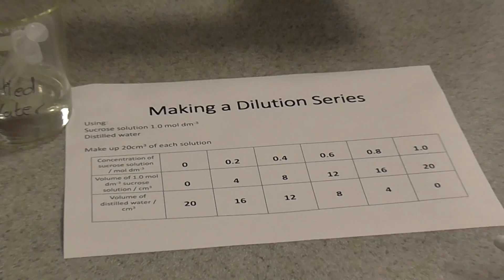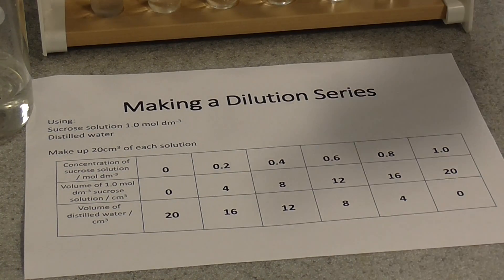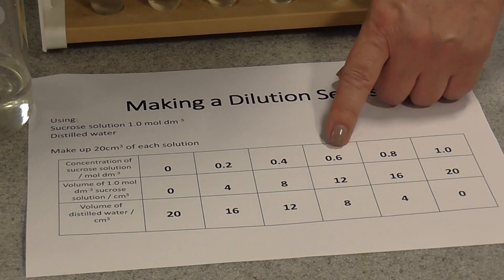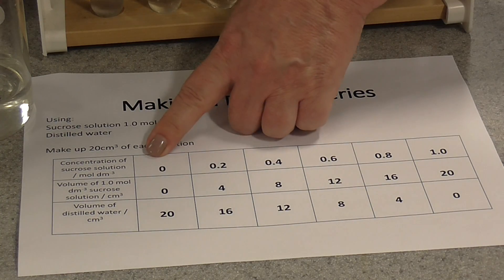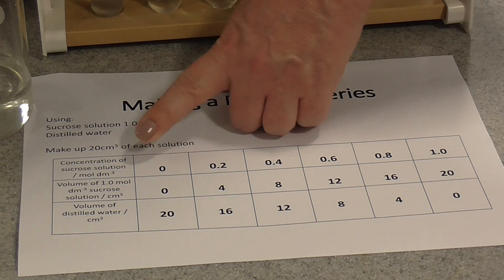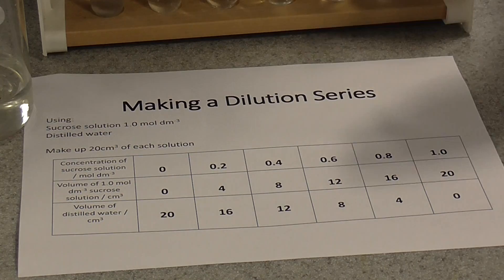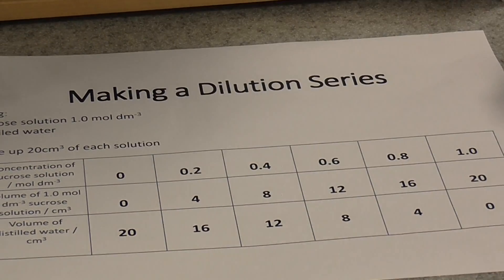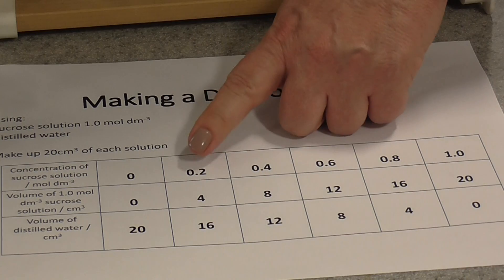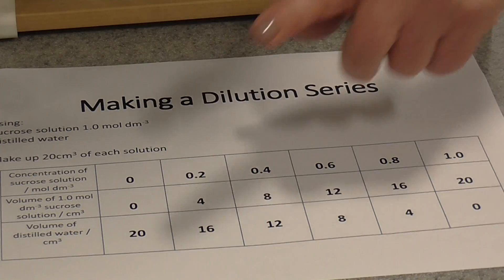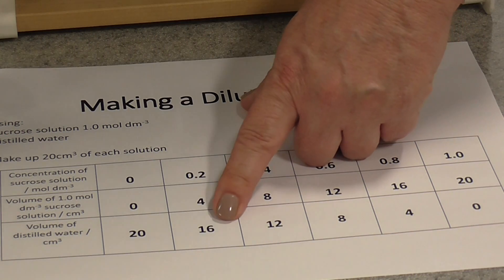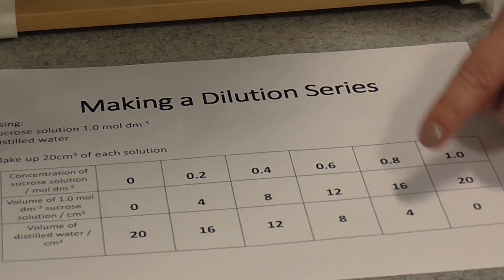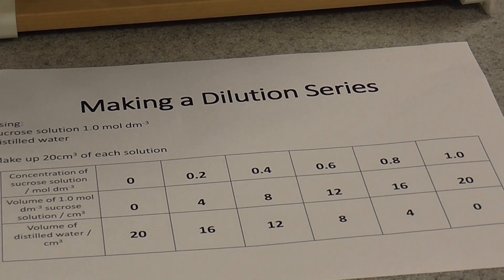First you'll need to label your test tubes. You see I've already made my dilutions here. These are the different concentrations of sucrose solution that we're going to prepare. To make twenty centimetres cubed up, obviously the zero moles per decimetre cubed concentration is just water - twenty centimetres cubed of water, no sucrose. Our 0.2 mole per decimetre cubed solution will need four centimetres cubed of the one molar sucrose solution and sixteen centimetres cubed of water. This table shows you how to prepare the rest of your dilution series.